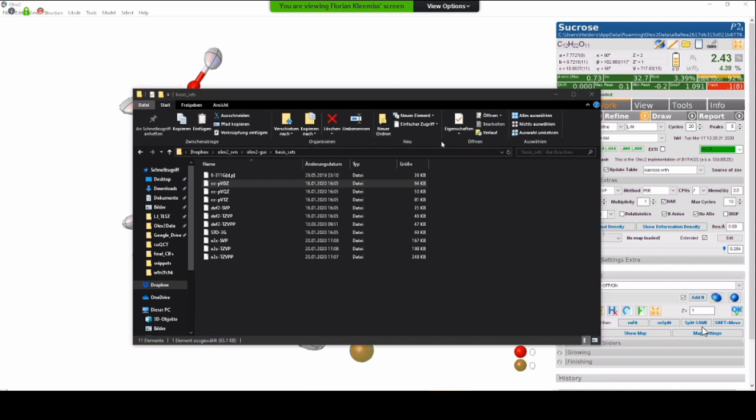In principle, you would have to play around with that. From my point of view, but this is maybe a bit naive, I would say just select what suits your data best, and then try to argue afterwards whether this makes sense. So you look at the multiplicity that gives a good result, and then you try to understand whether this suits your metal situation.